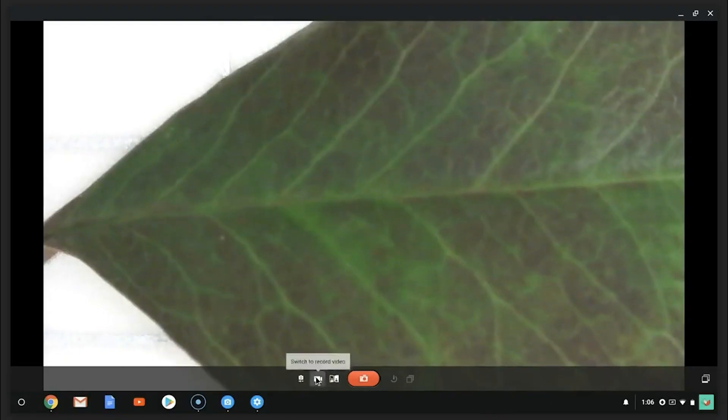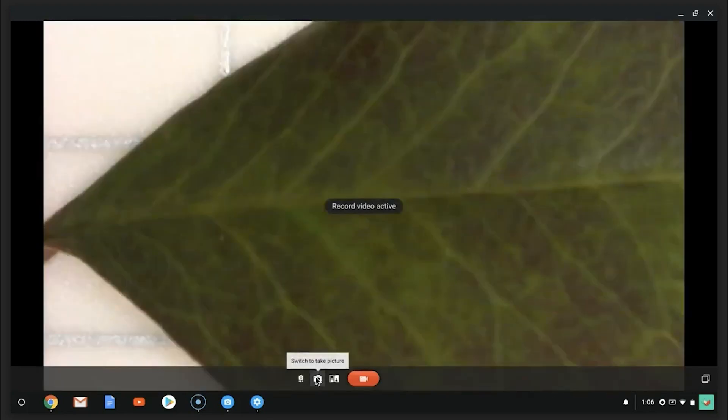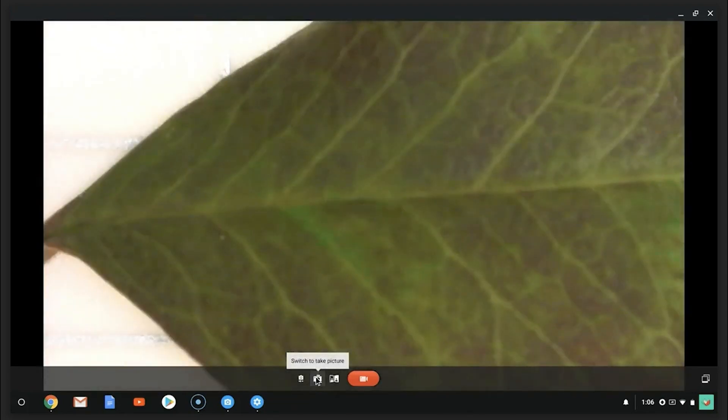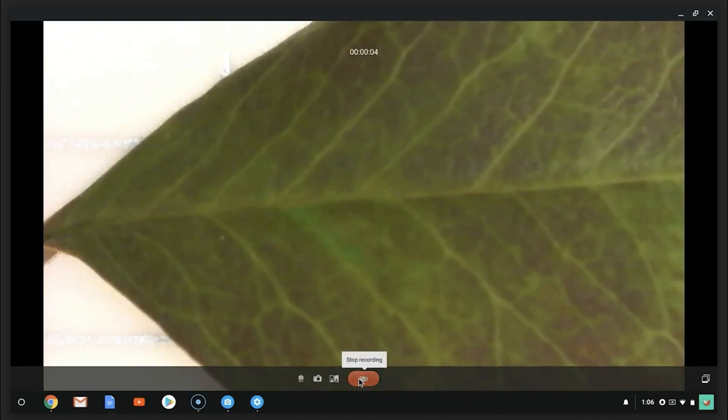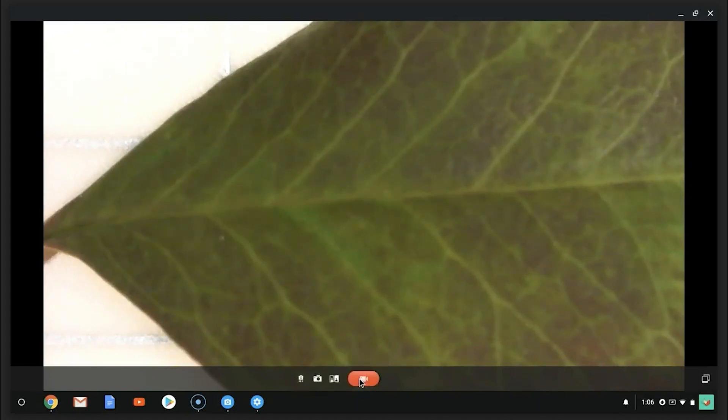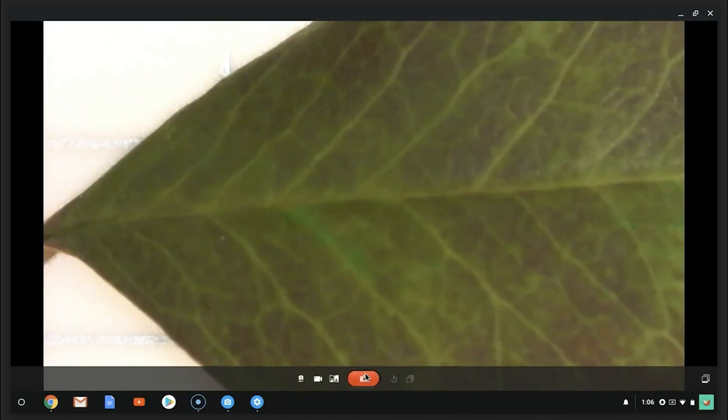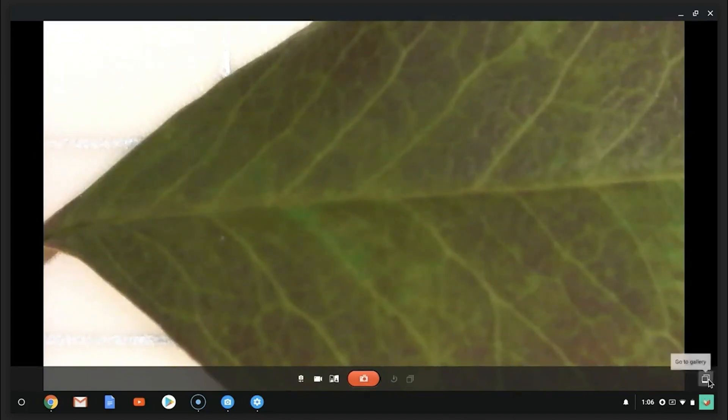To take a video, click on the white video camera icon to switch to video mode. Click the red button to begin and end recording. View your pictures and videos by clicking on the white icon in the bottom right corner.